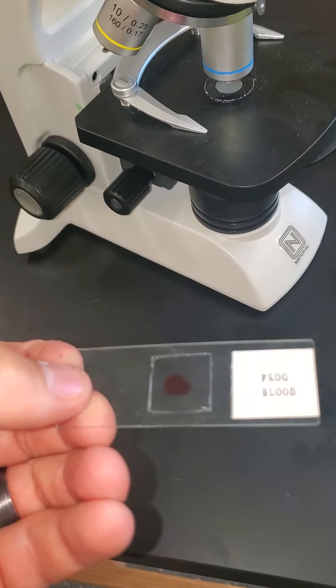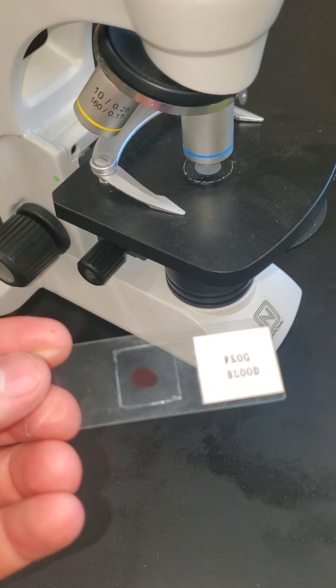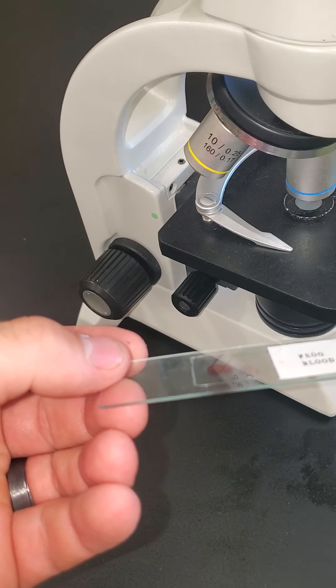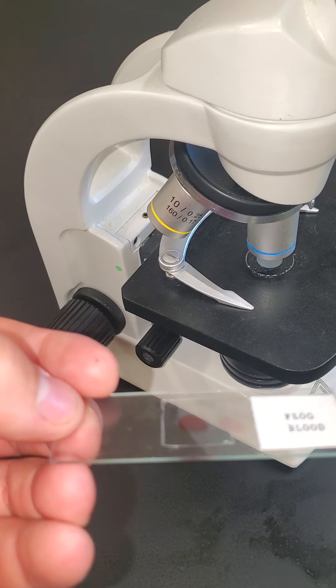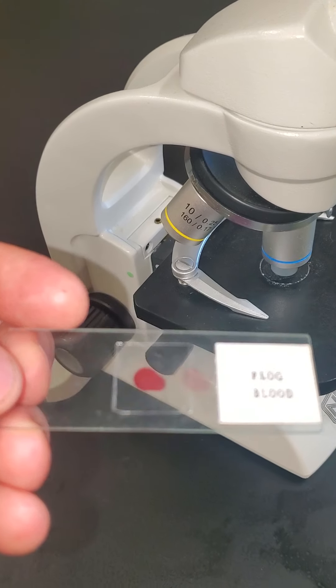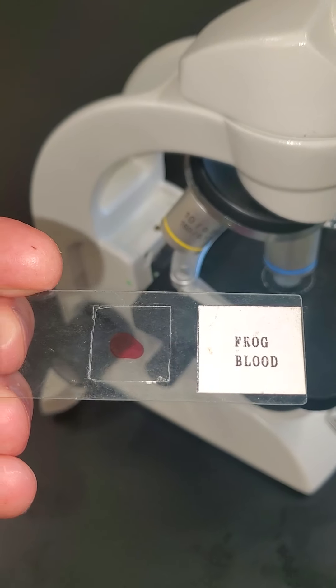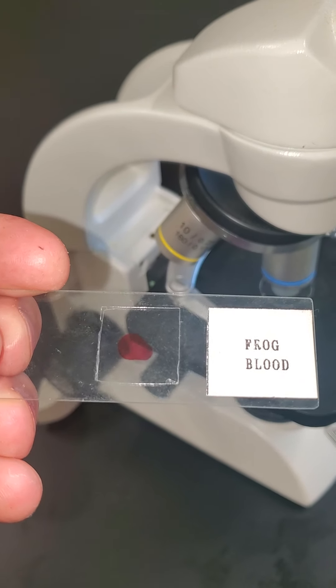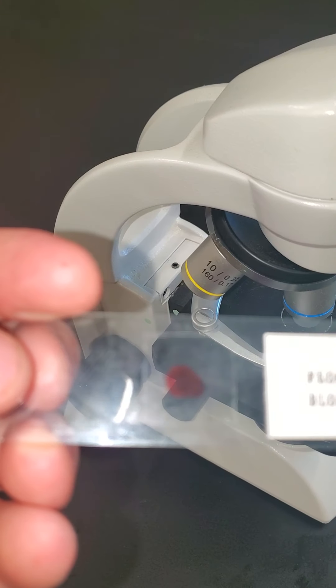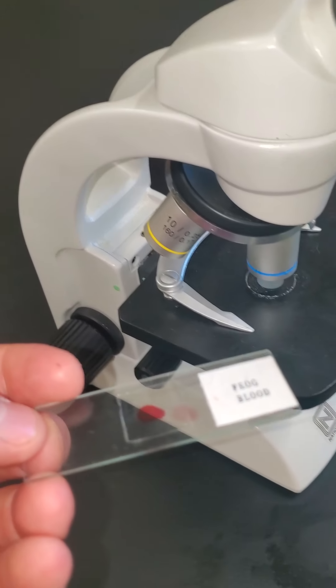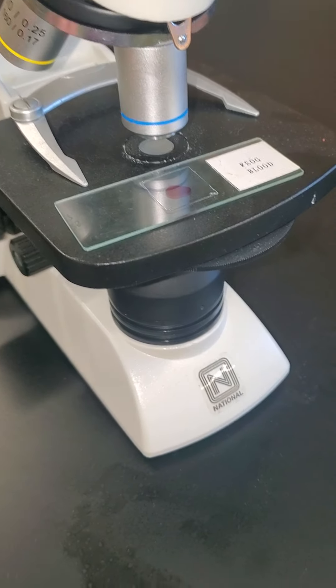We typically will have a specimen or a sample in a slide like this. It's a glass slide with, in this case, frog blood on it. There's a slide cover protecting and pinching the frog blood in between two surfaces, and that would go on the slide table.